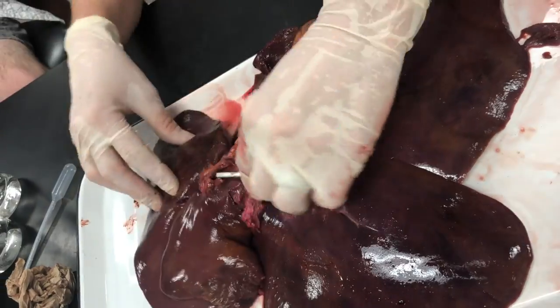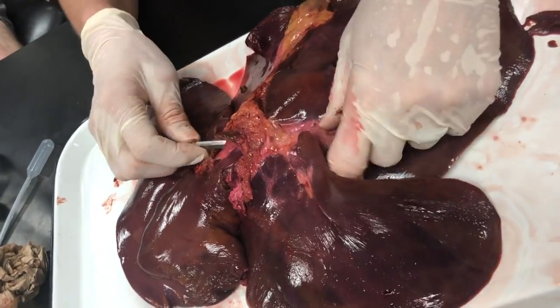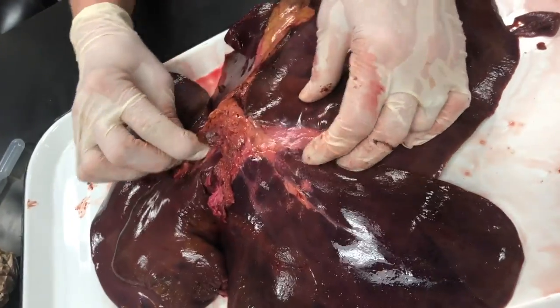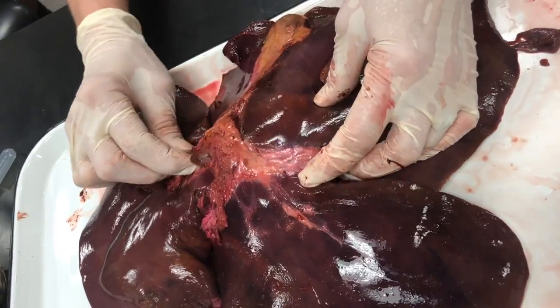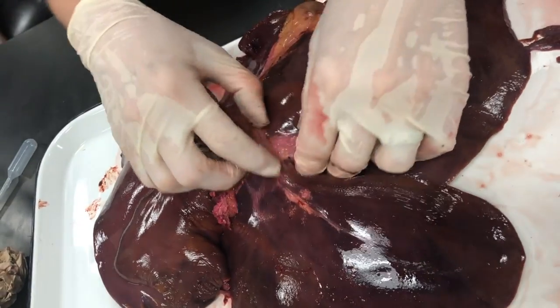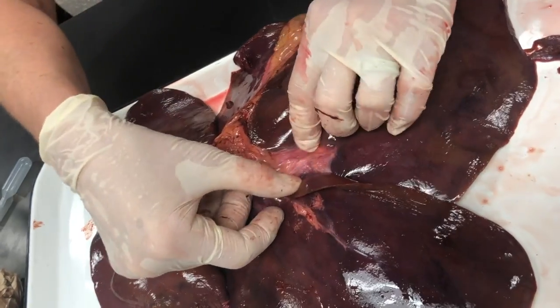All right, so the hepatic portal vein is usually associated with an artery, and sometimes if I kind of pick around in the fat on the top, I can find where that is. So see where my probe is right now? See how wide that is? That's the vein. The arteries are going to be relatively teeny tiny things that are on the top.